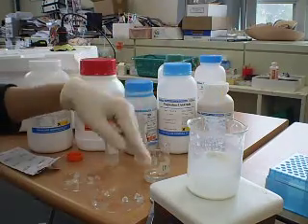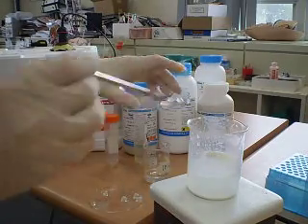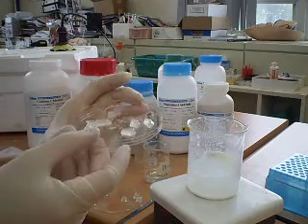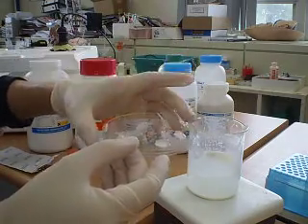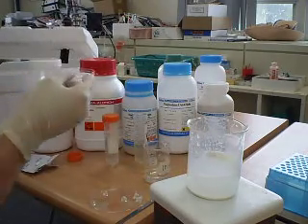Once the two solutions react, we are going to get bead formation. I will transfer the beads out into this container. The beads now contain soda lime, magnesium oxide, and calcium oxide, which can be used to absorb CO2. From there I am going to transfer them into this CO2 sensor.